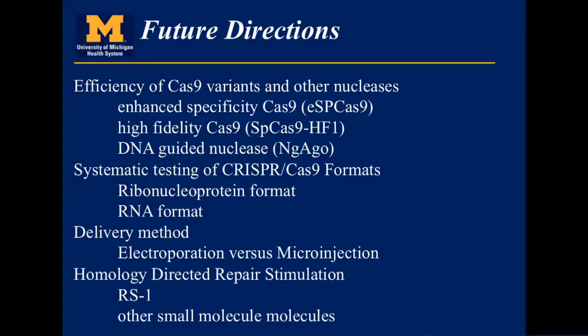In terms of the field, it generally recognizes that homology-directed repair is the bottleneck. People have tried the SCR7 small molecule inhibitor of DNA ligase 4 to knock down non-homologous end joining, and our experience is, yes, it knocks down non-homologous end joining, but it doesn't do anything to increase homology-directed repair with the DNA donor.